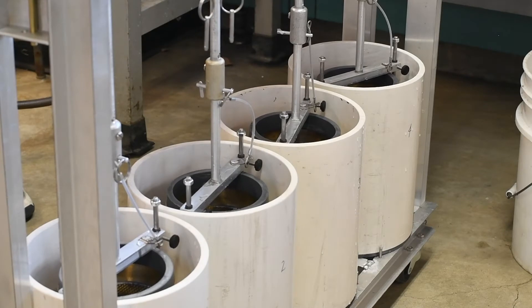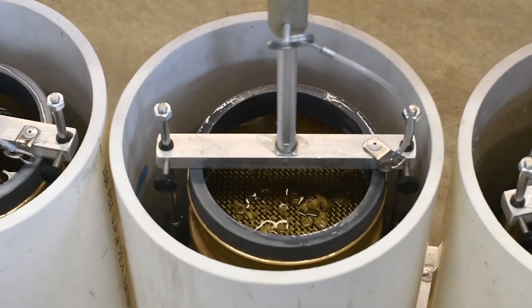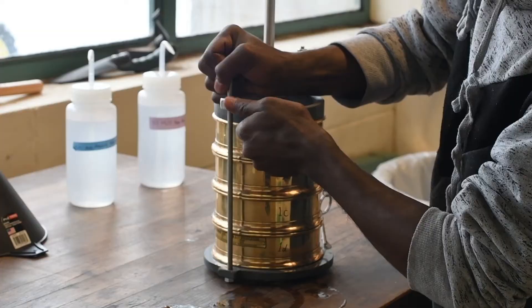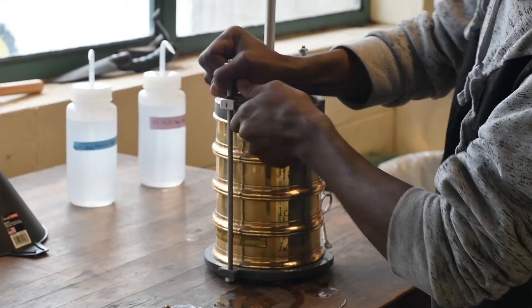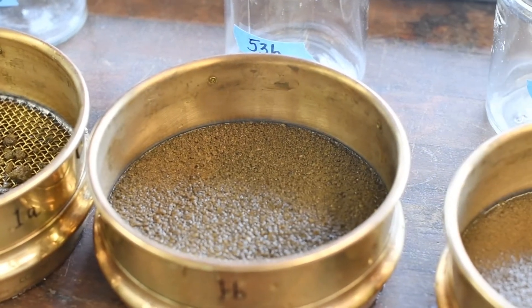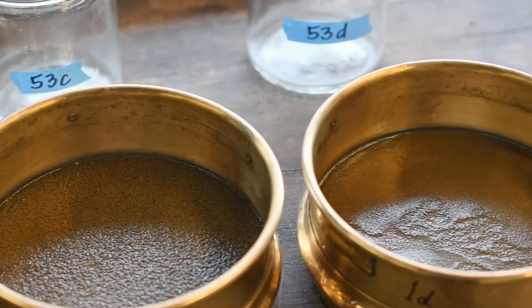This apparatus is called a modified yoder device. Our machine is set up to run four samples at a time. Each station consists of a drum filled with water and a stack of sieves. For our soils, we use four sieve sizes, which are sizes two millimeters, 500 microns, 250 microns, and 53 microns. You may decide to use more or fewer sieves or different size sieves depending on your soil.